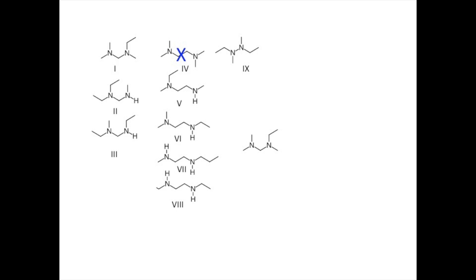Even if they were adjacent, as in a hydrazine molecule, we would need to break at least 4 bonds in order to lose molecular nitrogen. It is possible to lose a molecule of ethylene.